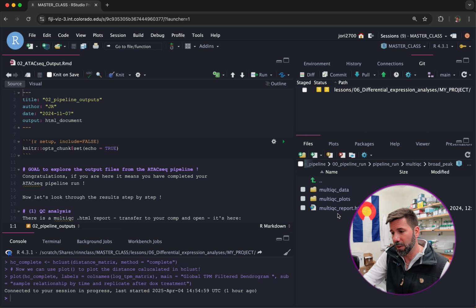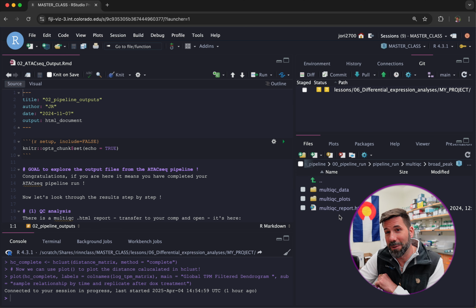For simplicity, that just means it's willing to spread the window of where it says the peak starts and stops, which is going to foreshadow the next few classes. Starts and stops are positions of peaks in a sequence of DNA. We'll be doing a lot with those in the next lesson.